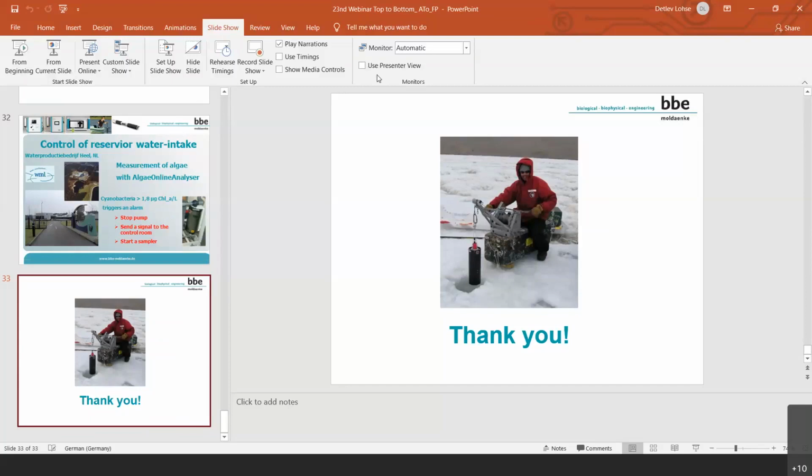But we know that formazine is very well accepted all over the world, and so we use it, and it is okay because we only use it for the correction. So if you really want to rely on the values that you obtain and want to make a measurement of turbidity, I think a turbidometer is the better instrument. Okay.